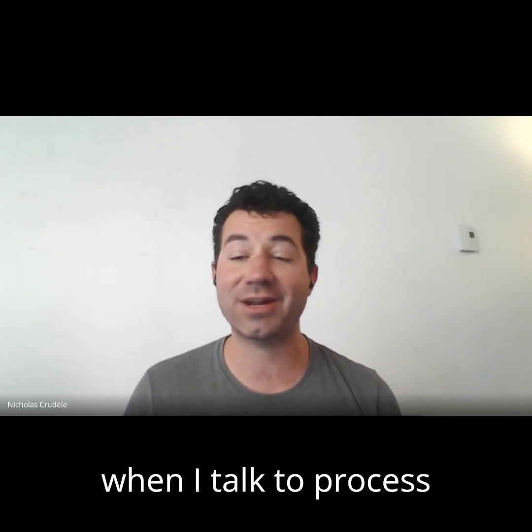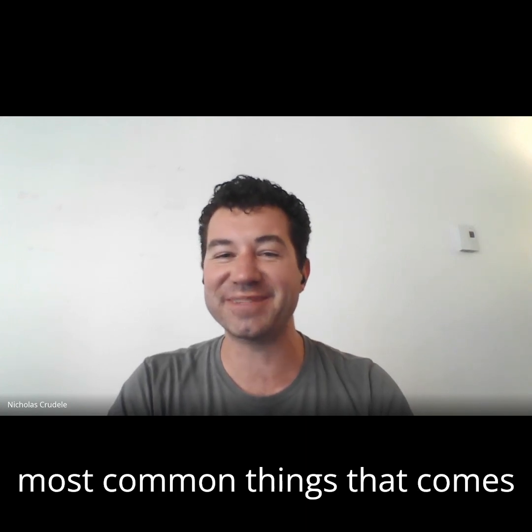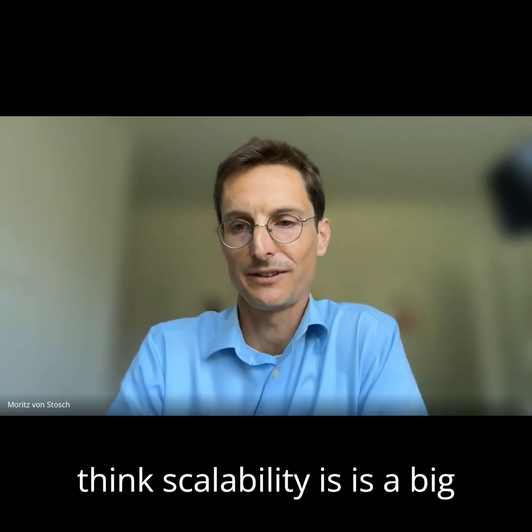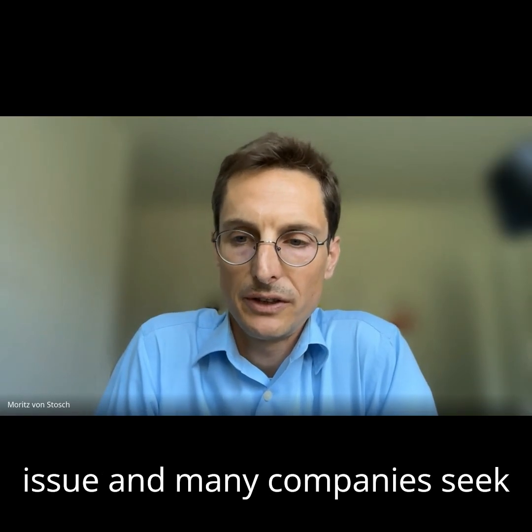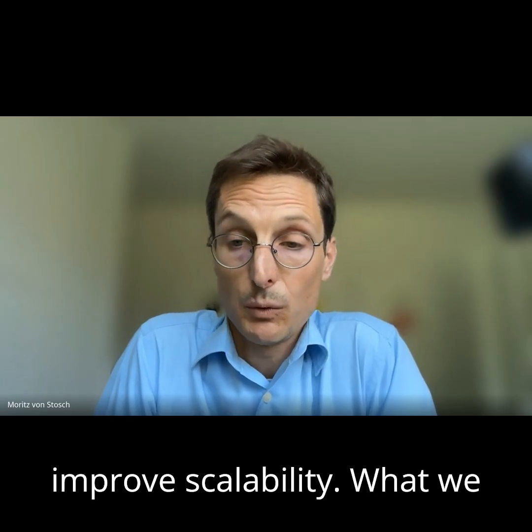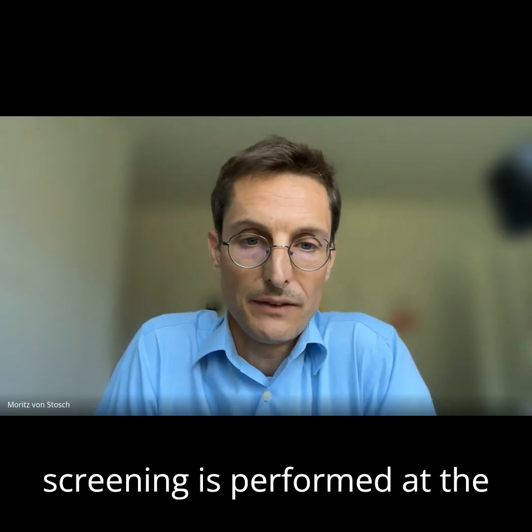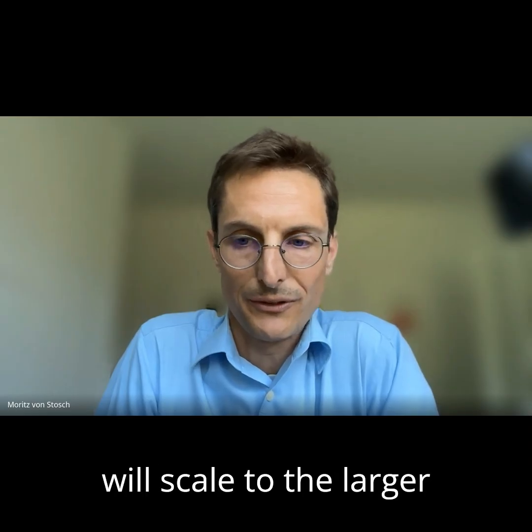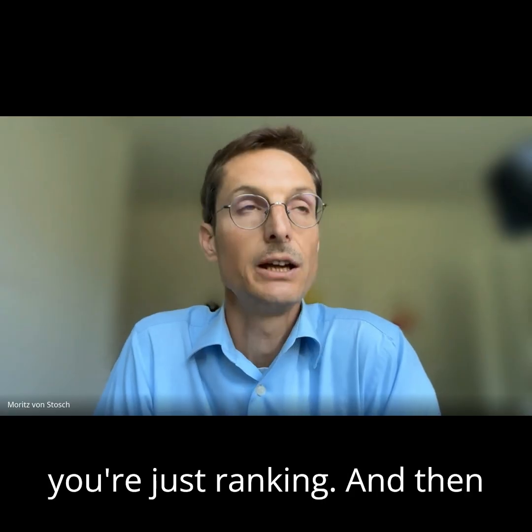I've heard when I talk to process development engineers, this is one of the biggest and most common things that comes up. No, absolutely true. I think scalability is a big issue, and many companies seek to use modeling in order to improve scalability. What we see is that a lot of screening is performed at the shake flask, not giving much thought to how the process will scale to the larger scale, which is fine, right? You're just screening, you're just ranking.